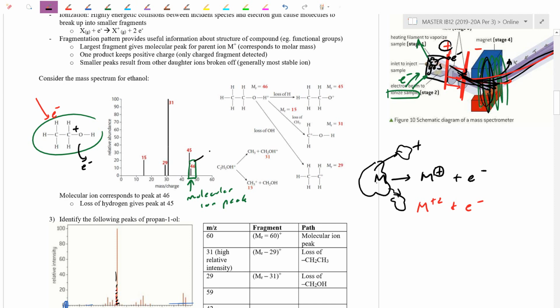I can do a little bit of empirical formula, molecular formula work with that, because that one there is my true molar mass. And then depending on the actual fragmentation pattern, depending on what I'm actually breaking off, there's two ways of looking at it. I get these bars here. Either look at the bar itself. This bar here is 15. On your data booklet, 15 is actually, coincidentally, the mass of a CH3 grouping.